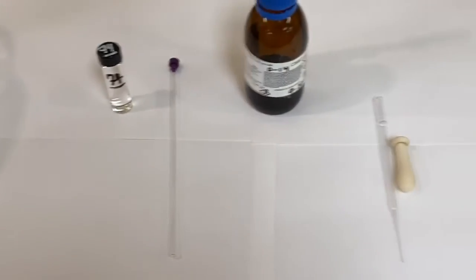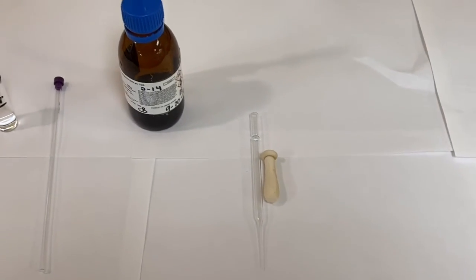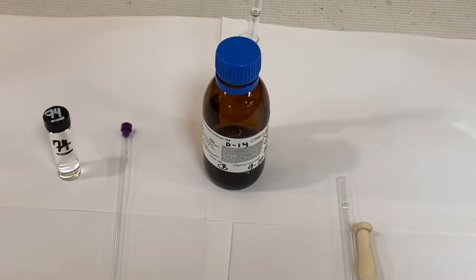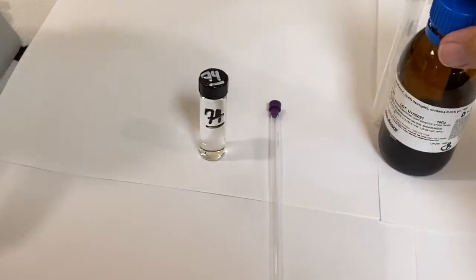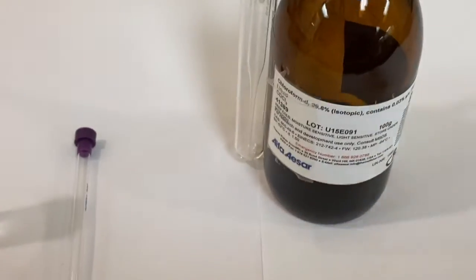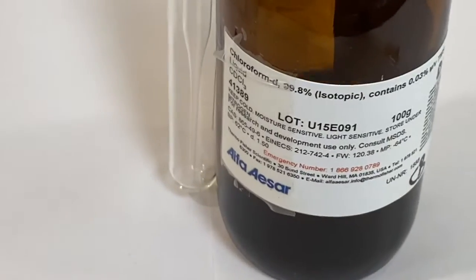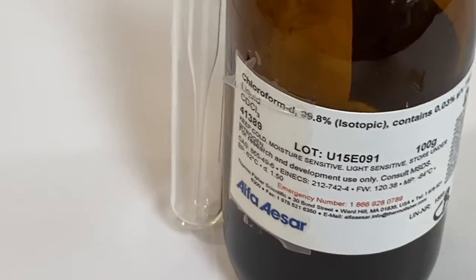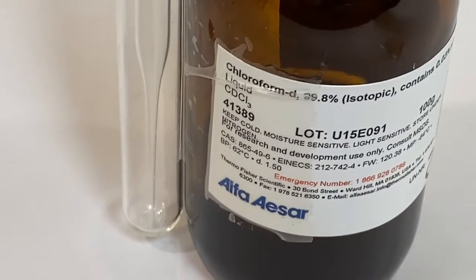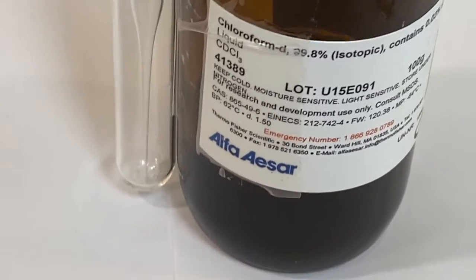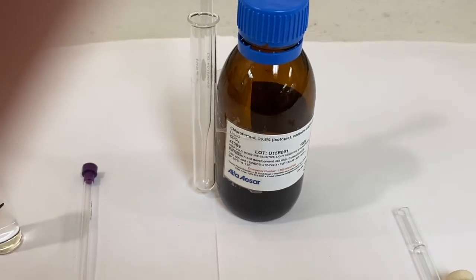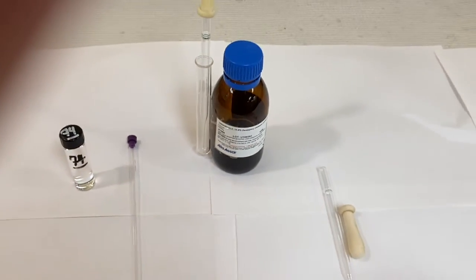You'll also need a clean pipette and a bulb and access to a bottle of deuterochloroform which is found in the hood. It's important to read the label before you use it. It needs to say chloroform D. It also contains TMS as the standard set to zero.